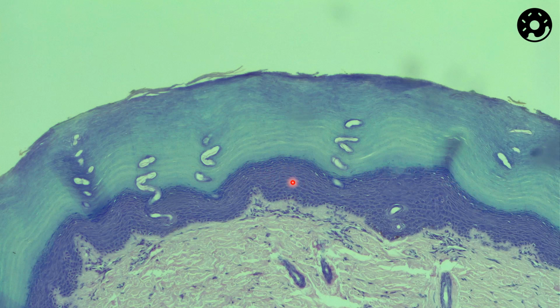Now, this texture right here is going to be Stratum Spinosum, okay? So Stratum Spinosum is where it looks less compact, less tight, less dense, and a slightly lighter shade of what we're seeing in the Stratum Granulosum. So right here is going to be that Stratum Spinosum. And then at the very bottom, we have Stratum Basale. And Stratum Basale, I think basement, so it's at the bottom. So it's that very bottom layer that's touching this connective tissue right here.